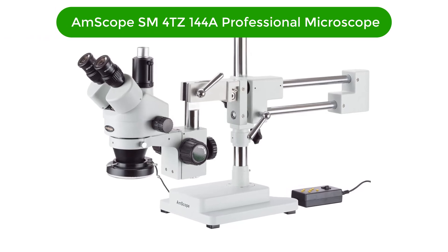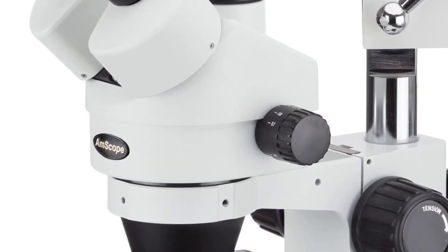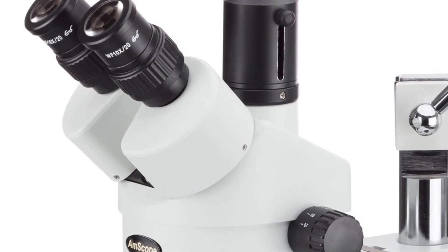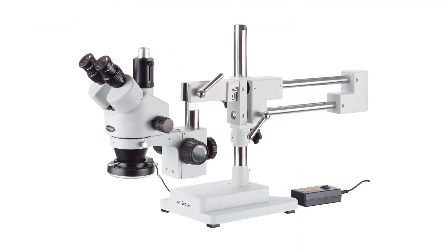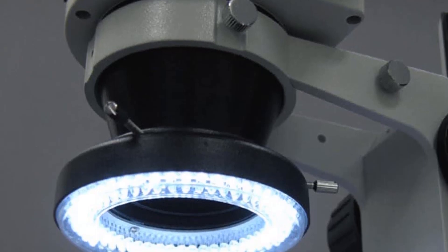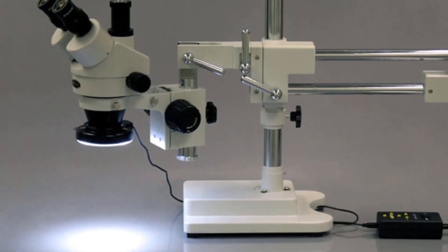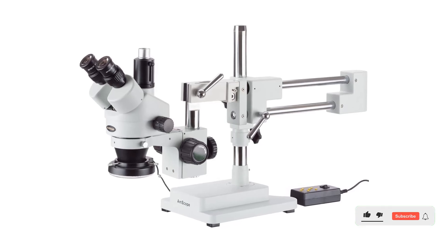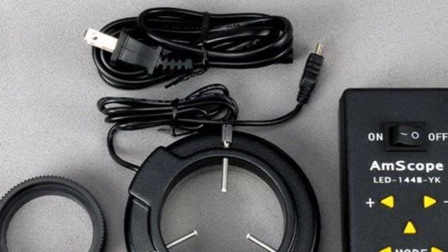Number four, our fourth best pick is the AmScope SM4TZ-144A Professional Trinocular Stereo Zoom Microscope — the perfect choice for professionals or advanced hobbyists looking for precision and accuracy. This microscope features a powerful 3.5x to 90x magnification range and 0.7x to 4.5x zoom flexibility. For illumination, it has a 4-zone LED ring light for variable lighting intensity. It also includes 0.5x and 2.0x Barlow lenses for added versatility, and is designed to work with 110V to 240V power sources.